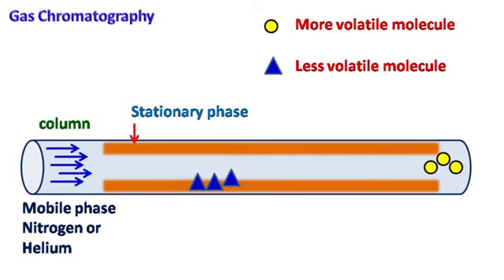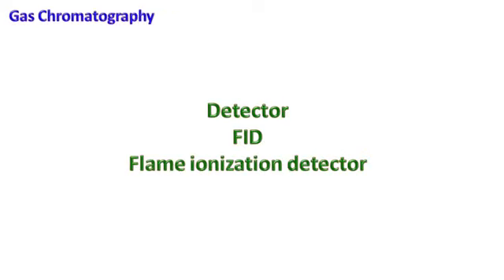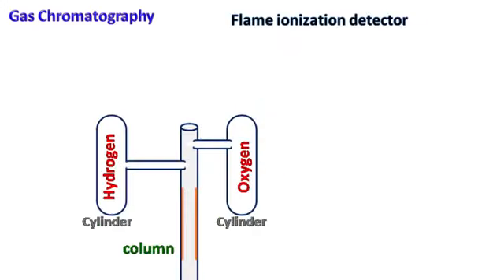Once the separation is completed, the detection is done with a detector attached at the end of the column. One of the most common detectors used with gas chromatography is the flame ionization detector, or FID. The flame ionization detector has 3 inlets: one for the carrier gas which comes from the column, and the other 2 for hydrogen and oxygen.